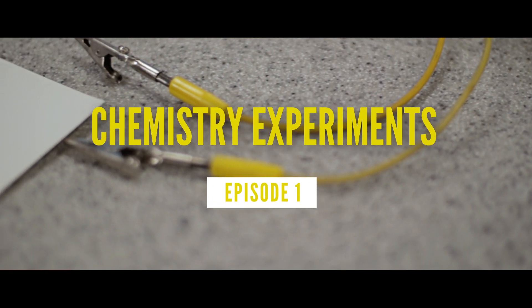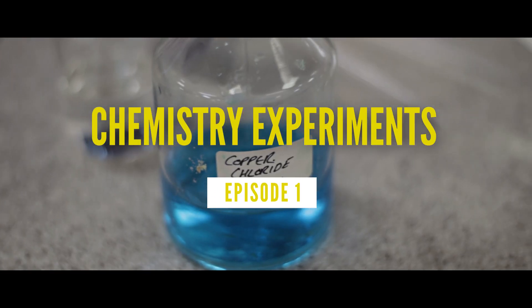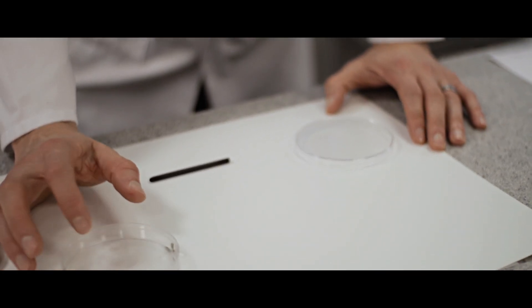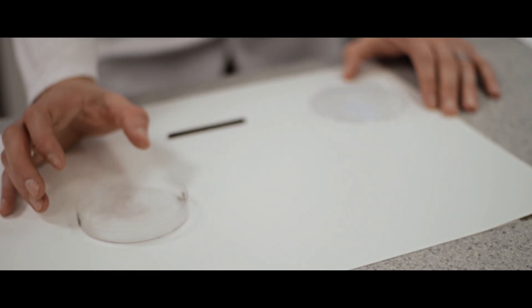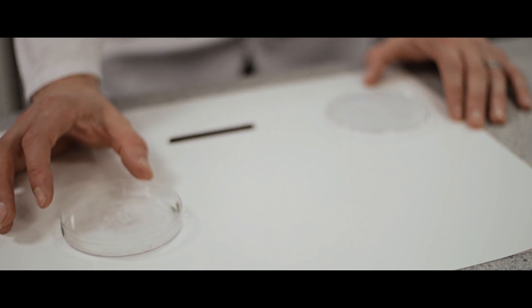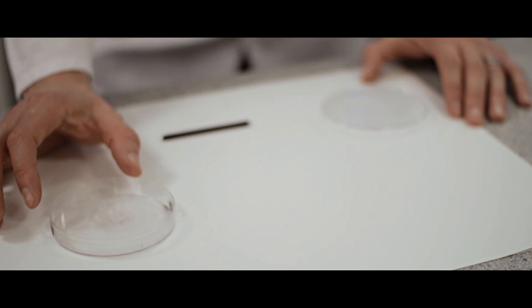In this practical we're going to be doing electrolysis of copper chloride. We're going to use this as a microscale example of electrolysis and we're going to use a petri dish and put the chemicals in small amounts to show the process of electrolysis.